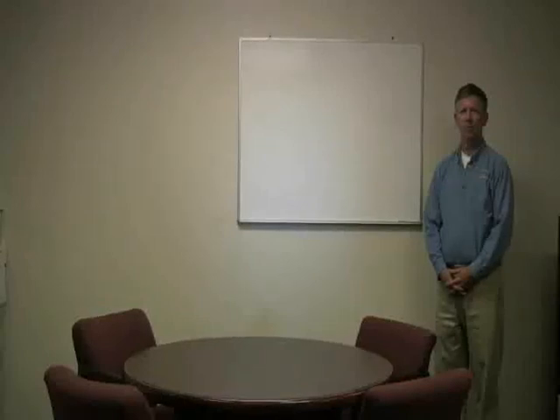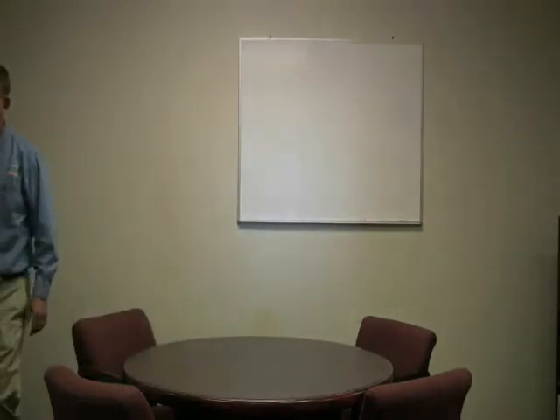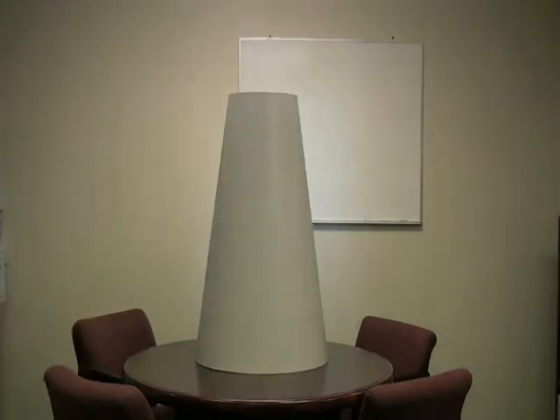Okay, now we're going to explain 5 concepts. Threshold, that applies to all of the other concepts. Fill quantity, bearing area, peak volume, and last, the bearing curve. Threshold is an artificial measurement of the depth of the sample above a certain level. That's considered in all the calculations.